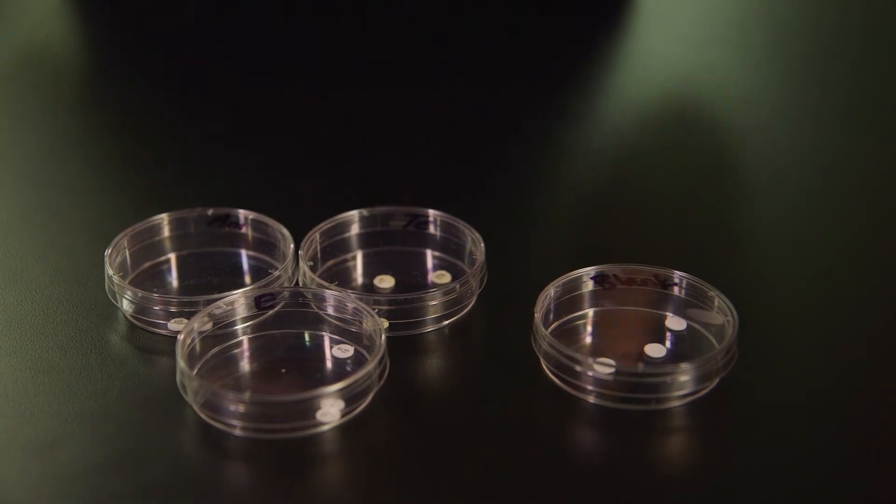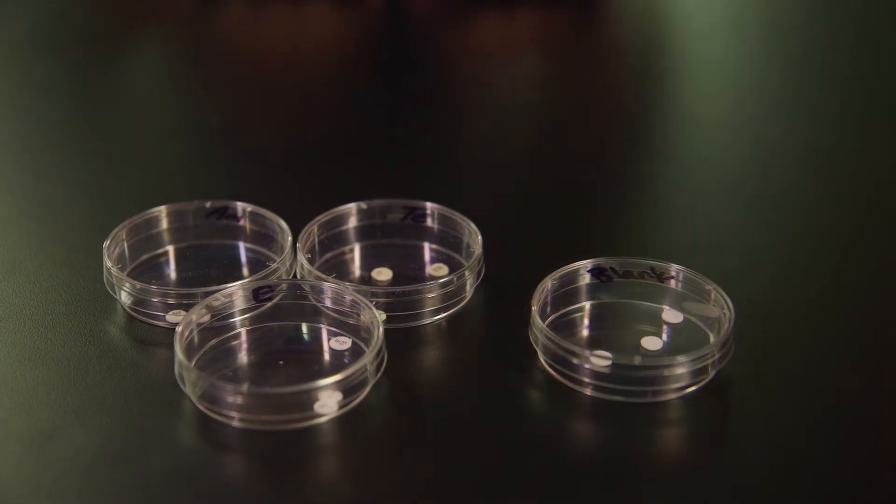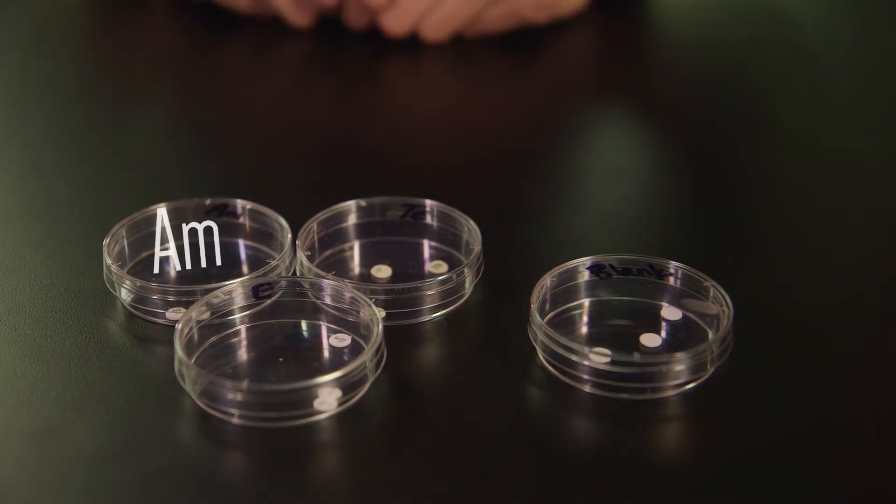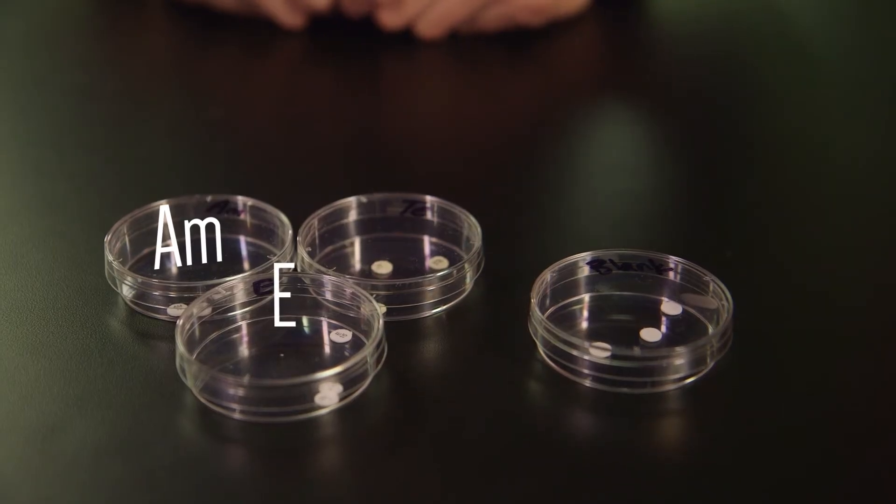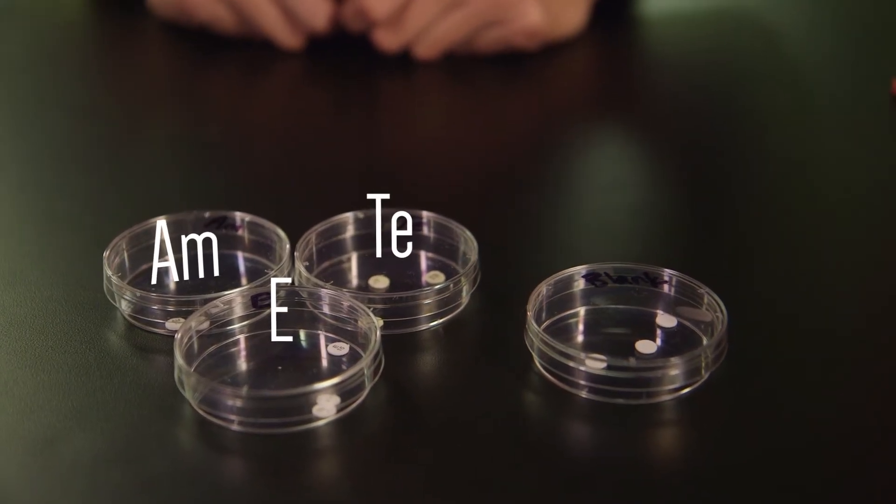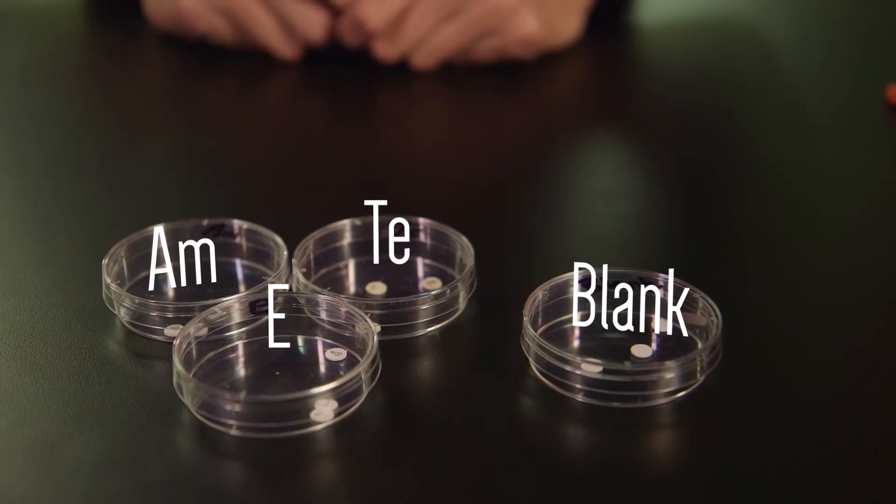Each of these sterile petri dishes contains a different antibiotic labeled with the initials of the antibiotic: AM for ampicillin, E for erythromycin, and Te for tetracycline. A fourth petri dish contains blank discs.